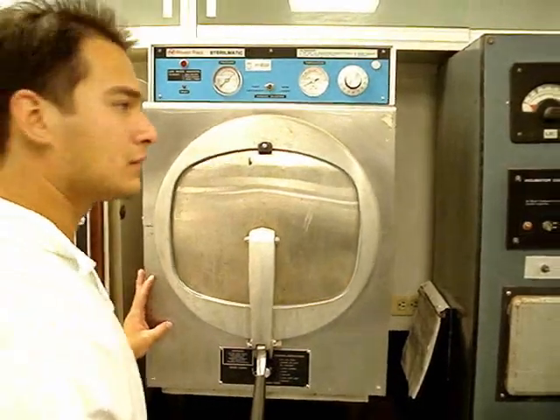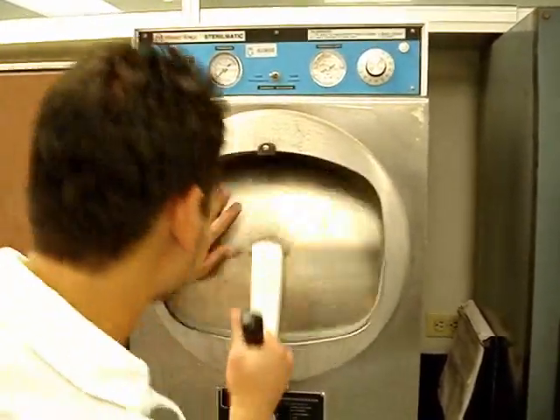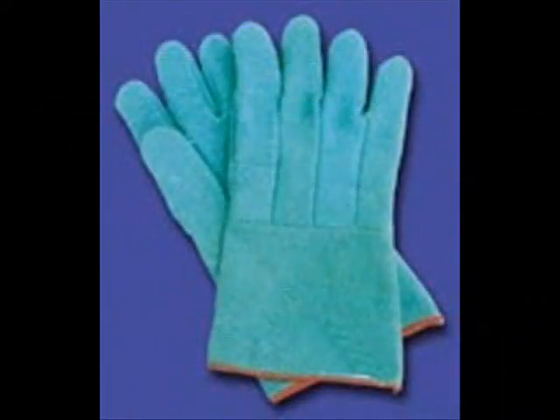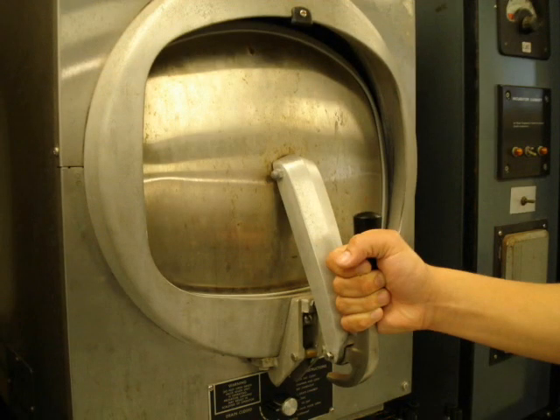¿Ya están listos los tubos? Sí, ya bajó la temperatura y la presión. Cuidado, cualquier cosa que acabe de ser esterilizada está muy caliente. Para sacar las cosas del autoclave, utiliza guantes aislantes, preferentemente de asbesto. No puedes abrir el autoclave hasta que la temperatura haya bajado por lo menos a 80 grados centígrados y que la presión sea de 0 libras sobre pulgada. De lo contrario, al abrir la compuerta, el vapor que salga puede quemar cualquier parte del cuerpo que te alcance.